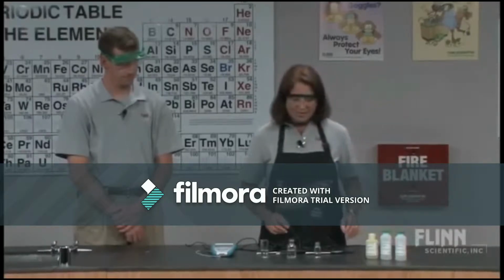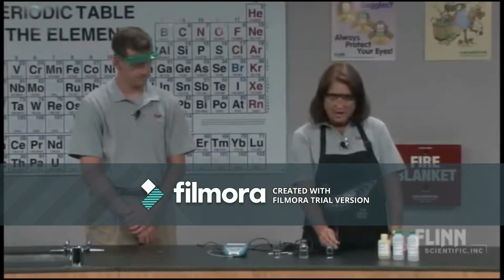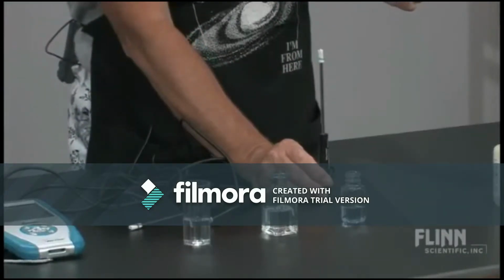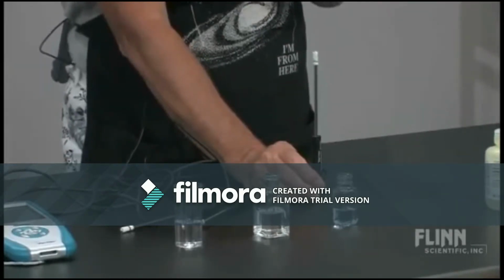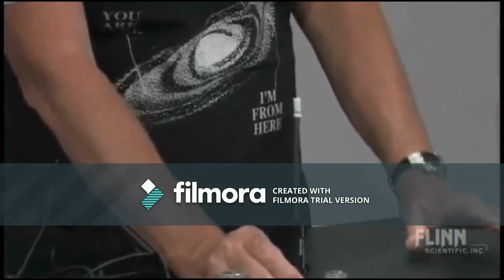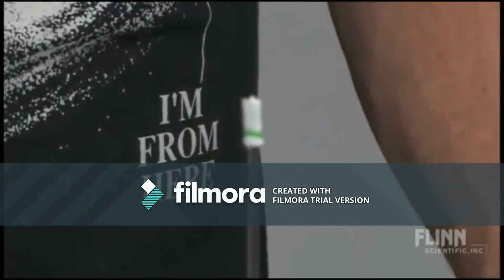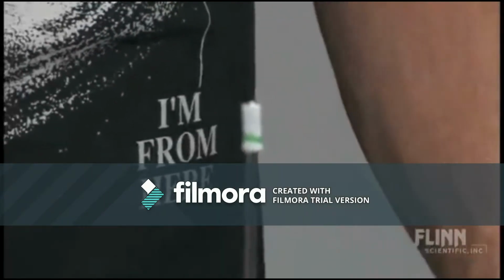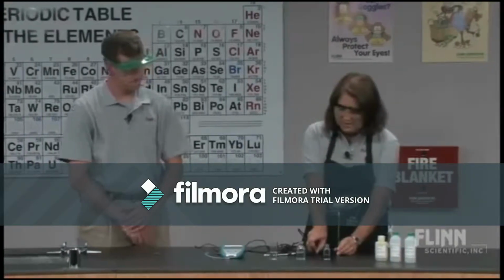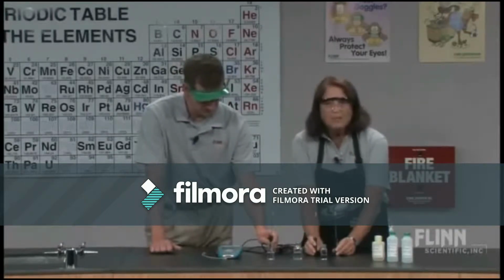Now the setup is simple. I have 3 temperature probes like this one. You'll notice that the temperature probe has a diaper on the end of it. Not really a diaper, it's just a piece of paper towel. And the paper towel has been folded around the tip of the probe, which is where the temperature readings are actually detected. And then secured with a rubber band so that it's going to remain at the tip of the probe.